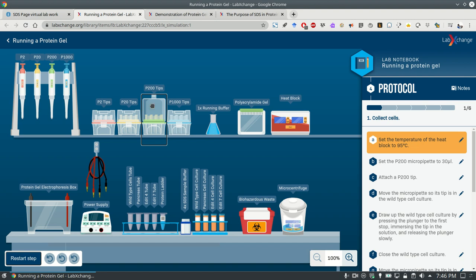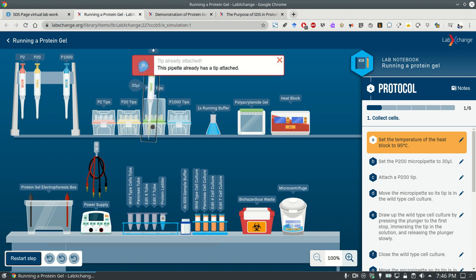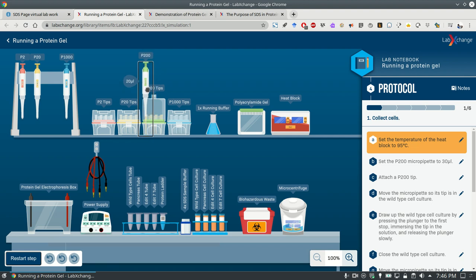Now, you have to open the box, and then you have to drag the pipette over there, and then you have to drop it. But you see, nothing has happened here. So you have to drop it in just the right place. You see that? It has taken me, I got lucky this time. I got the tip to go on the pipette my second try. But usually it takes me 5 tries to get the pipette tip to go on the pipette. You just have to figure out where to put it. And it's very much trial and error, right?